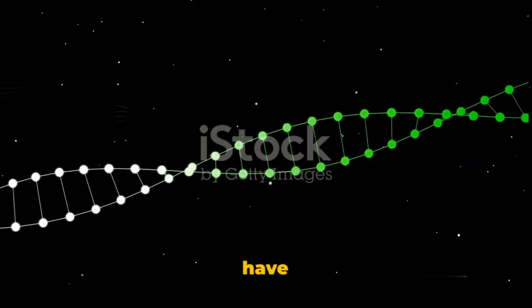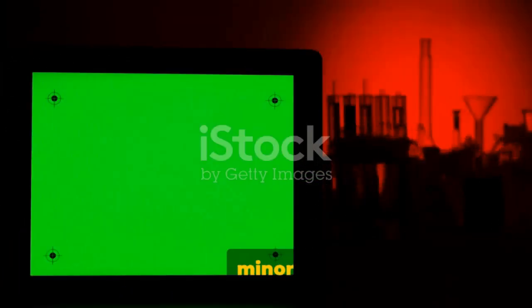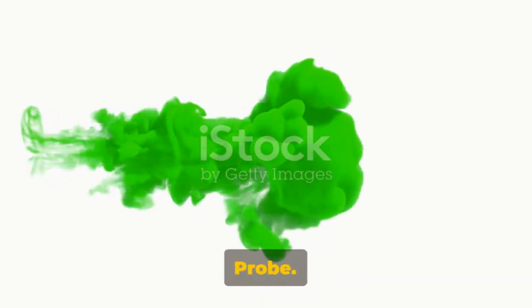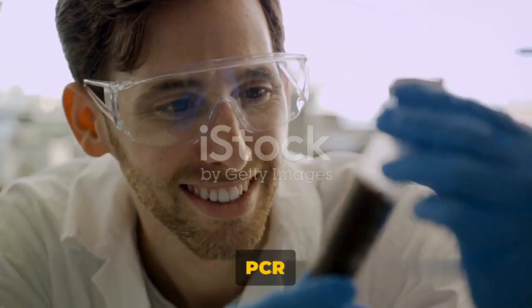On the other hand, we have SYBR Green, a dye that emits a strong fluorescent signal when it binds to DNA's minor groove. It's preferred for its ability to provide information about each amplification cycle and the melting temperature, although it's not as specific as the TaqMan probe. That concludes our exploration of fluorescence markers in real-time PCR. Remember, these markers are the unsung heroes of our PCR process.